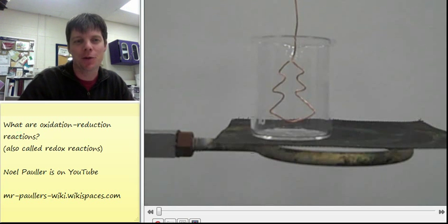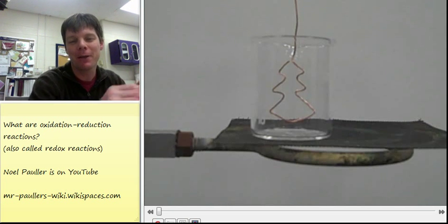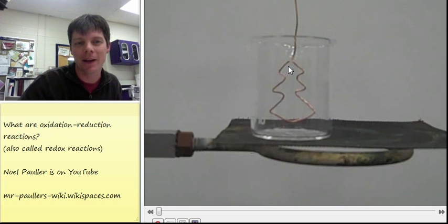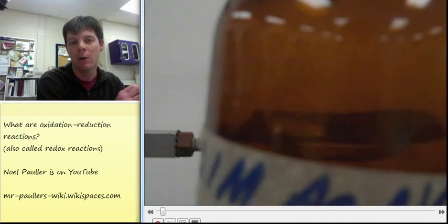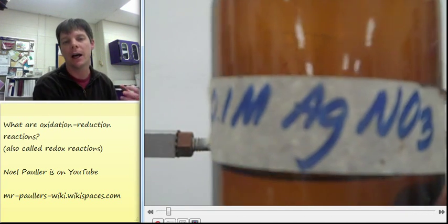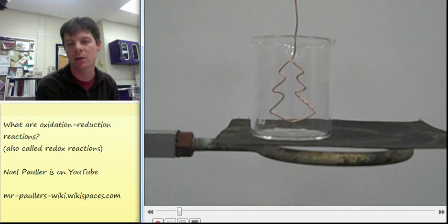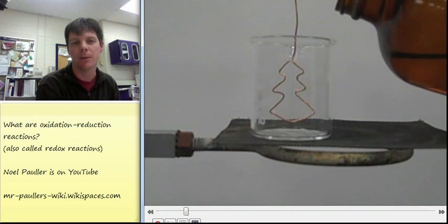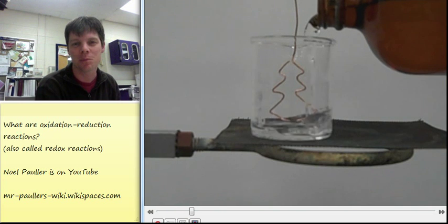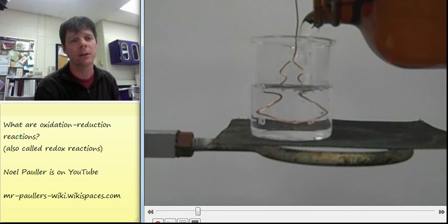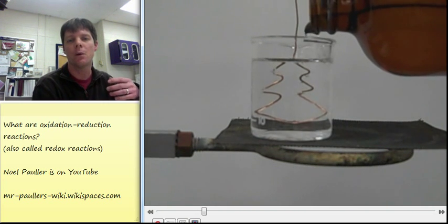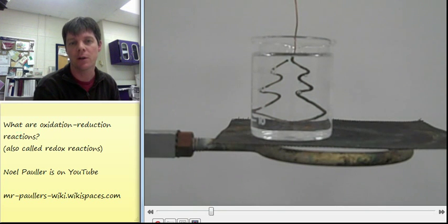Let's go ahead and take a look at this reaction. You can see I did a little holiday theme, so I have a Christmas tree. Thanks to Sue Carlson for helping me make that. This is solid copper wire, and to that we're going to add to the beaker some 0.1 molar silver nitrate solution. We're going to see the reaction that takes place shortly here. I actually did a little bit of time lapse for you, so this is going to switch to 32 times playback. Here we see it's going really fast right now.